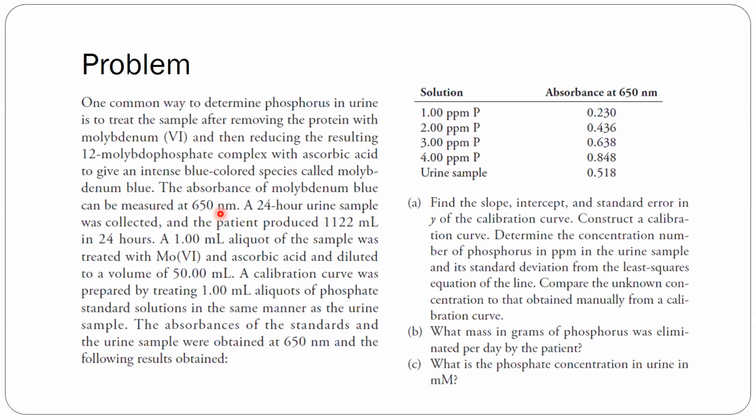Anyway, meron kang urine sample, 24-hour. So, probably, we don't know the actual procedure, but maybe ang requirement for this analysis is that yung urine sample mo dapat fresh. So, ang fresh siguro sa kanila ay 24-hour. I don't know why it's 24 hours. Maybe the intention of this study is to calculate the concentration of phosphate doon in a 24-hour time interval.